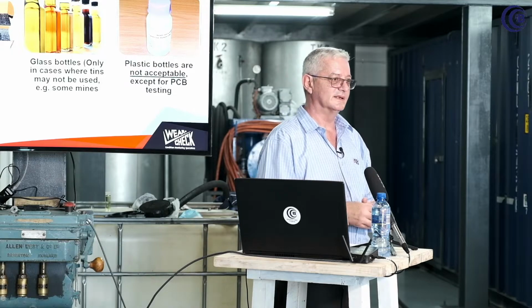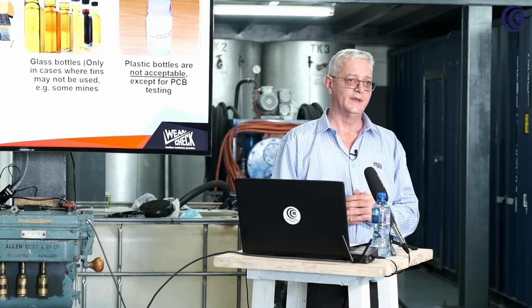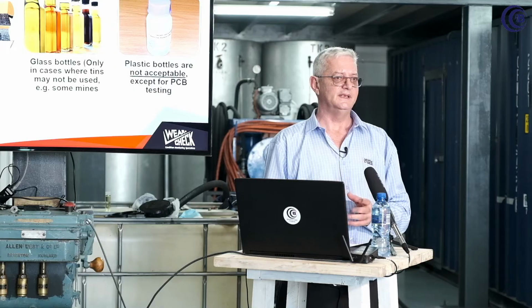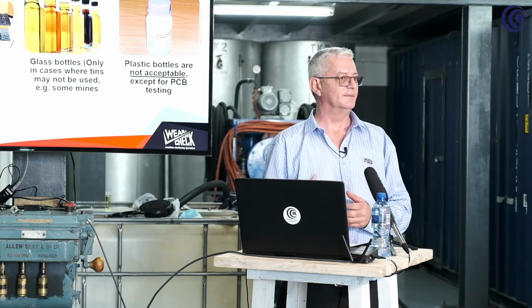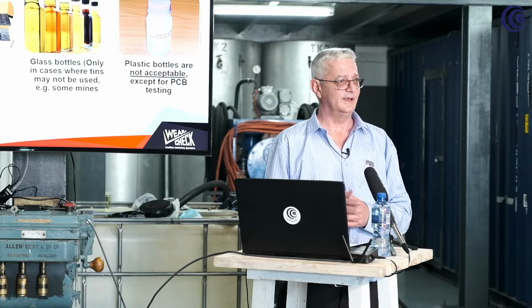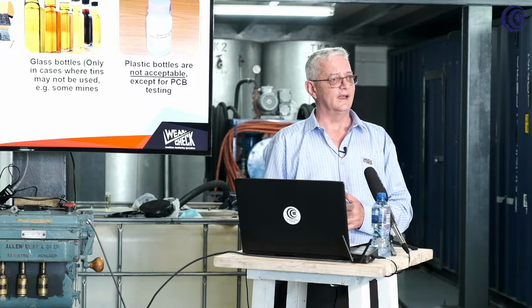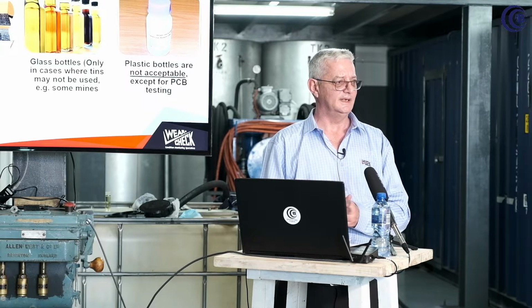The last bottle there is a small 100 milliliter plastic bottle, and that is for PCB. We only recommend that if a client only wants to test the PCB. If there's not a full range of tests, a lot of environmental testing is happening, and a lot of people are only testing for PCBs, then a client can use that bottle. It's a once-off bottle. Any PCB goes into plastic. We have to pay people a lot of money to get rid of that plastic for the environment's sake. We cannot do any other test out of it. That's specific for PCB testing.